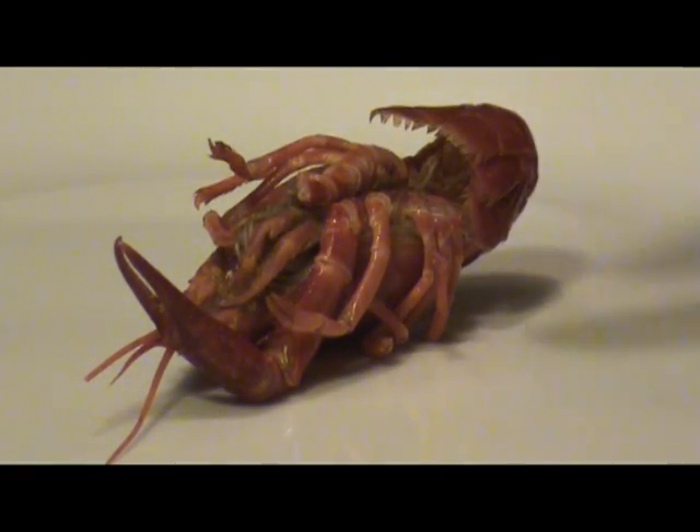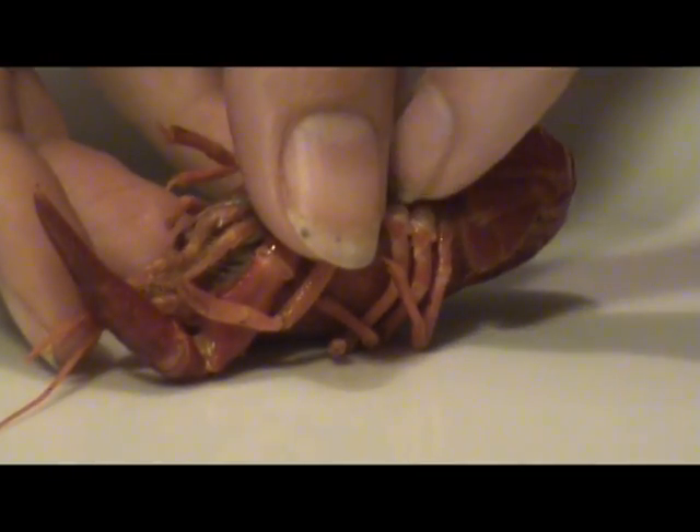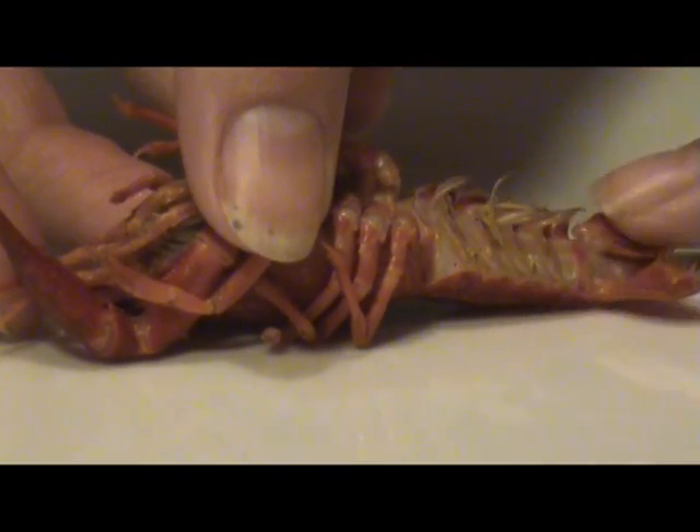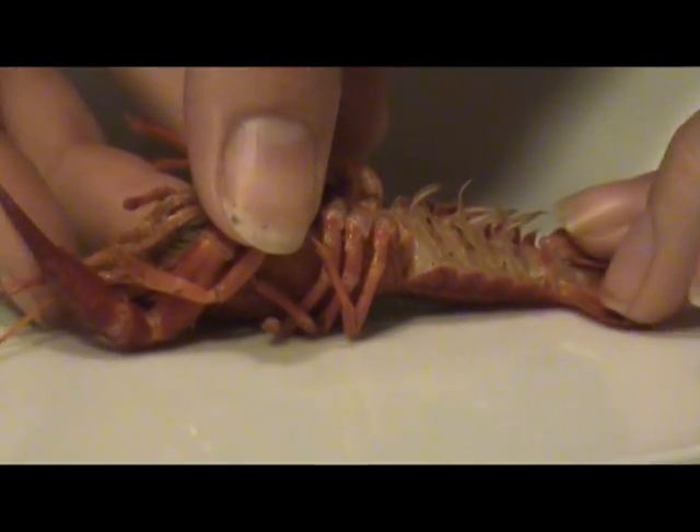This little guy is missing one. Let's fold down the turgum, and you'll notice more appendages. These are the swimmerettes. There are four pairs of those, or eight total as well.